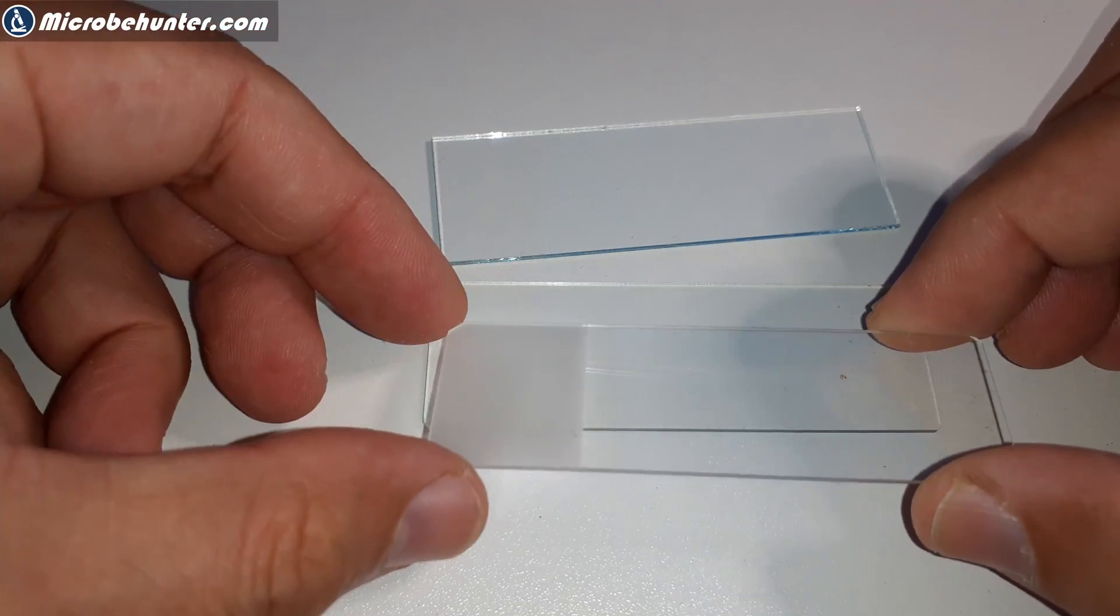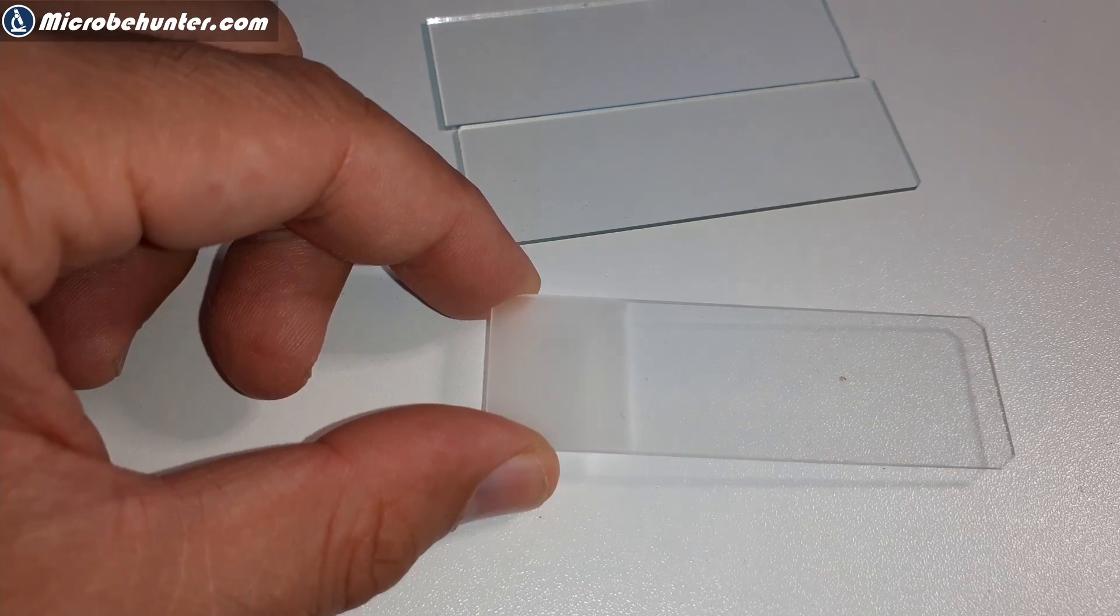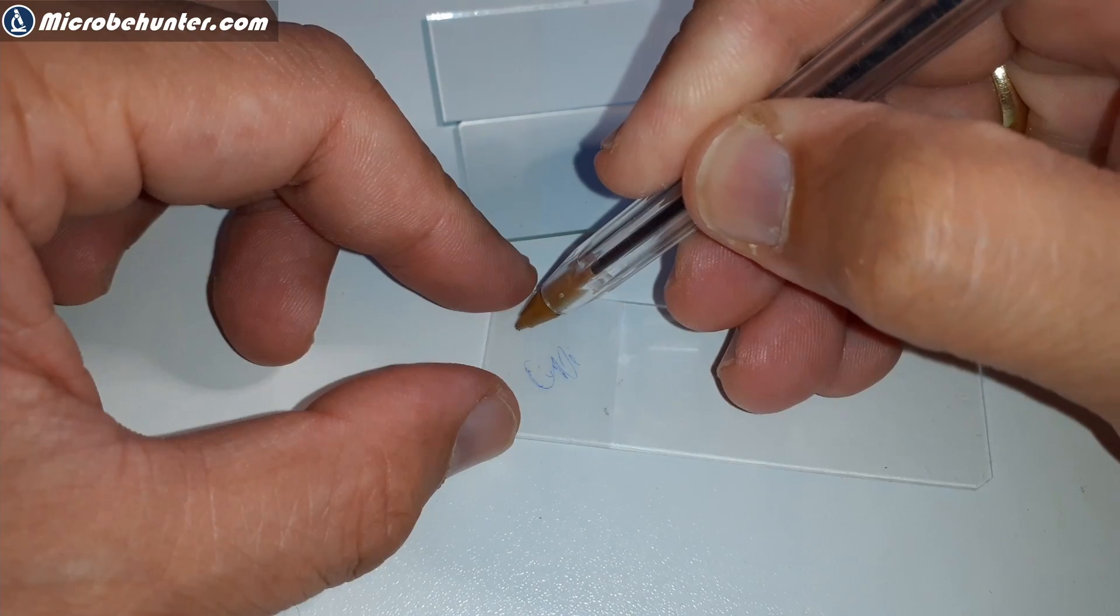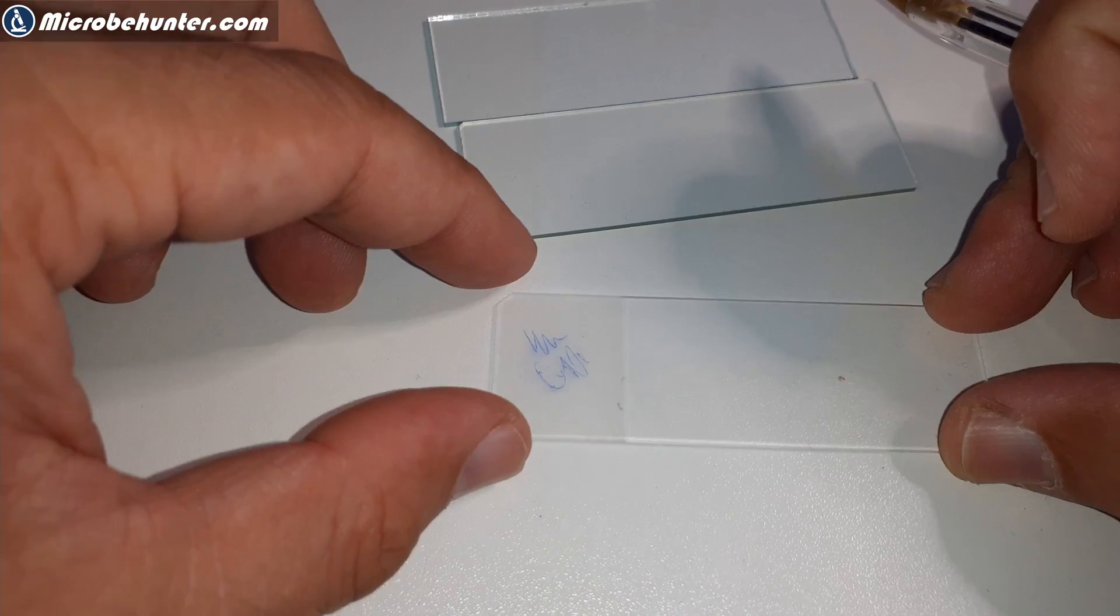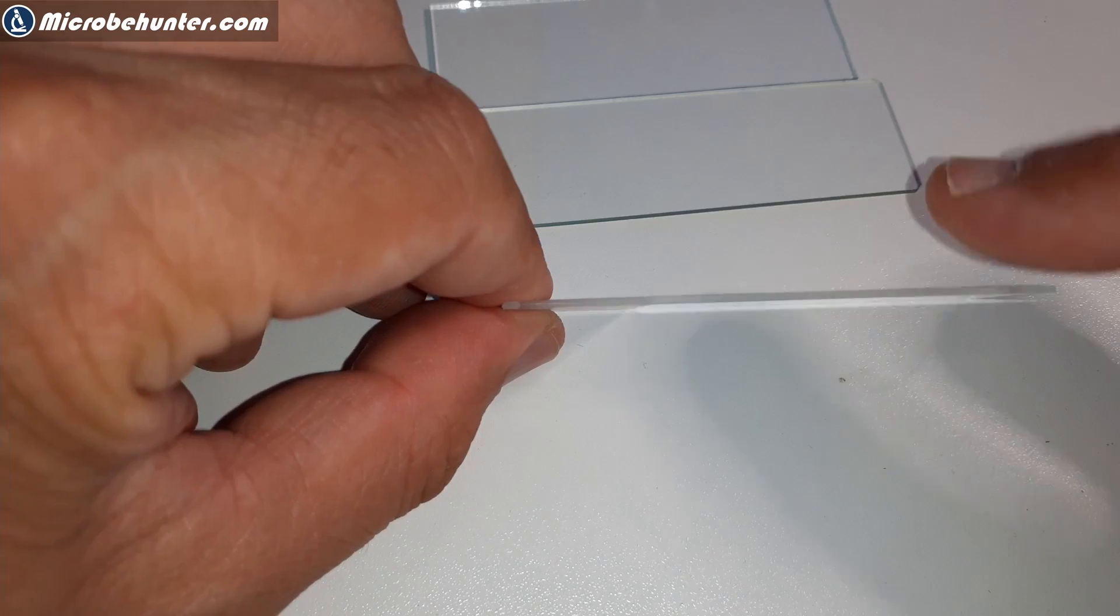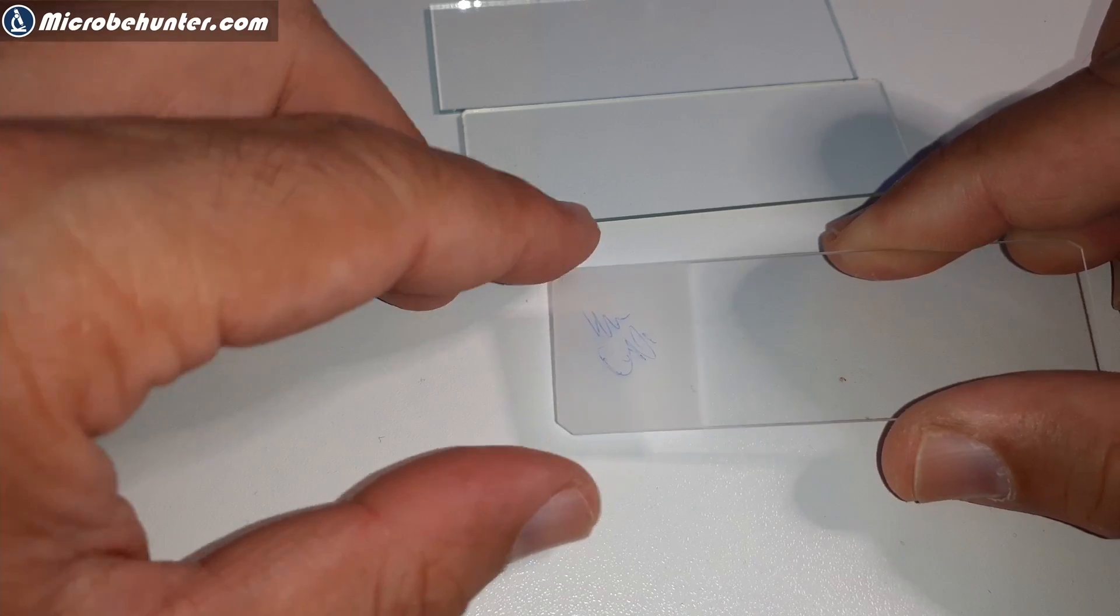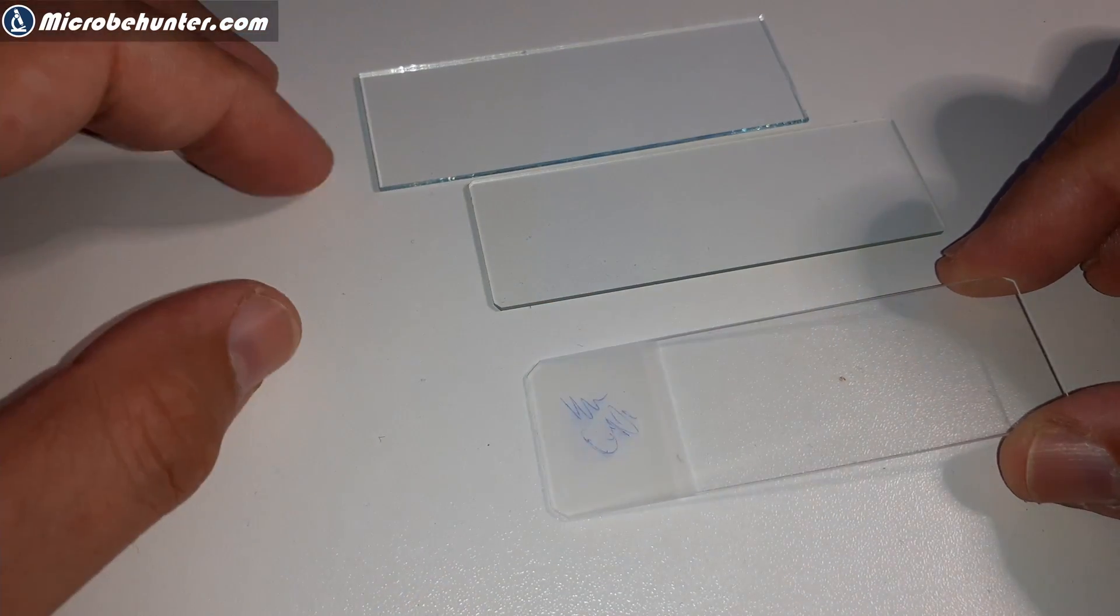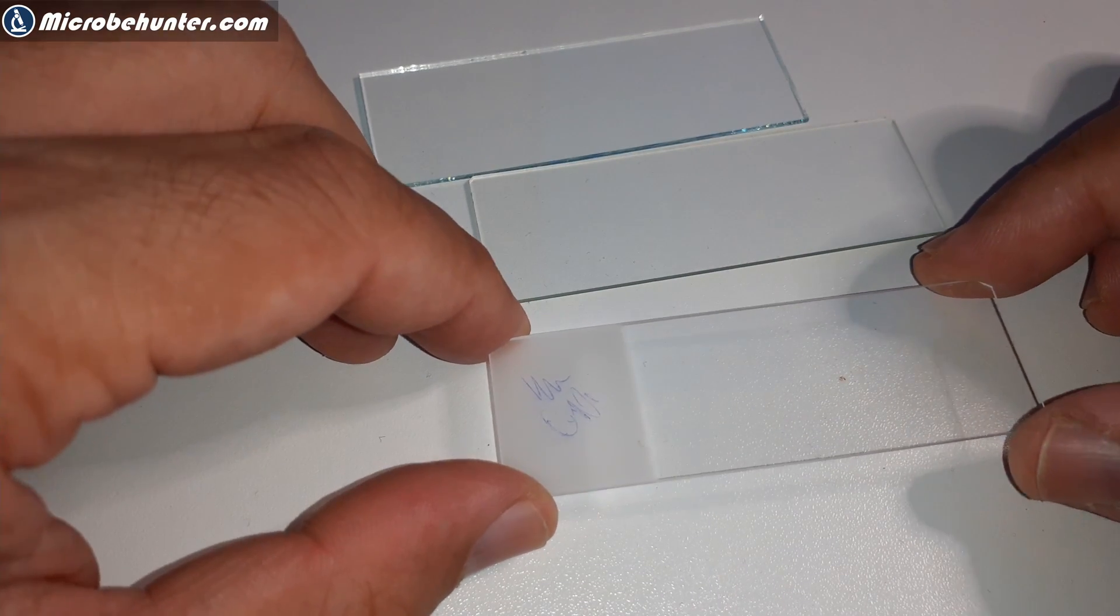There are also slides with a so-called frosted edge, which allows you to label the slide directly, not only with a pencil but even with a ballpoint pen. The writing is remarkably stable because you cannot wipe it off—you need to use alcohol. There are also some automatic devices that mount the slides, and glass pieces that come off might harm the mechanical system. For this reason, you sometimes use slightly higher quality slides that have ground edges and 45-degree corners.